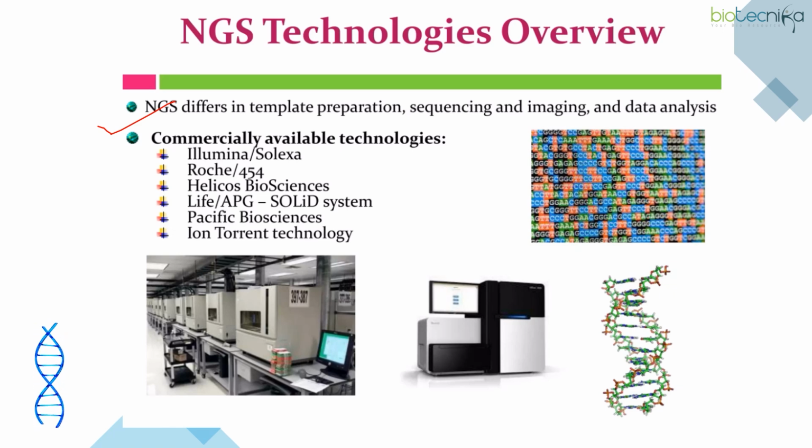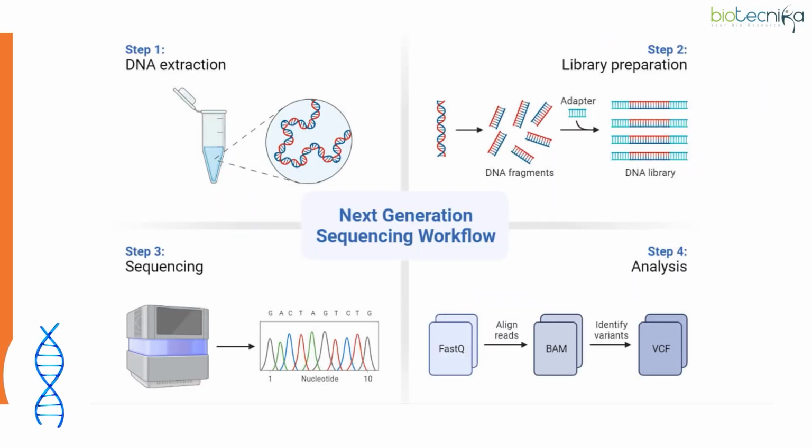Got it? So as you all can see, the workflow is in the tube, DNA extraction is done. Whereas in the second step, you can see there is a step called library preparation. So it will prepare your library based on the DNA fragments. Once the adapter is connected, it is called a DNA library. Okay.